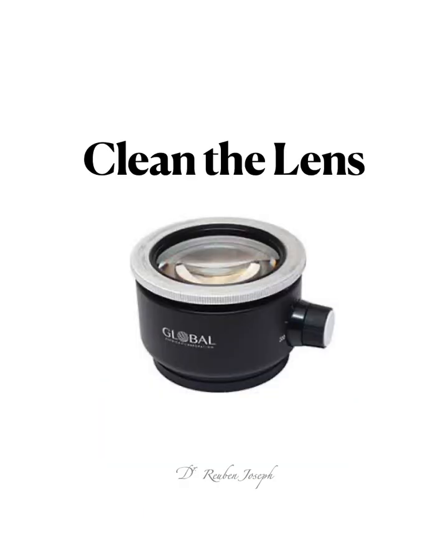So with this we come pretty much to the end of this little talk, and last but not the least, I have to mention one very simple thing that we all forget. We all work day in and day out. There is a lot of splatter going back onto the objective lens, and we forget to wipe them out after every case. These drops that are present on the objective lens tend to block light, which is very essential to get a good picture.